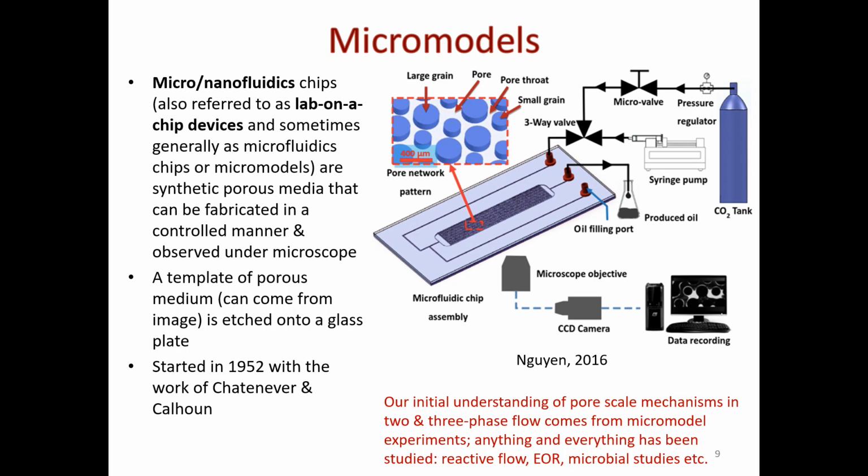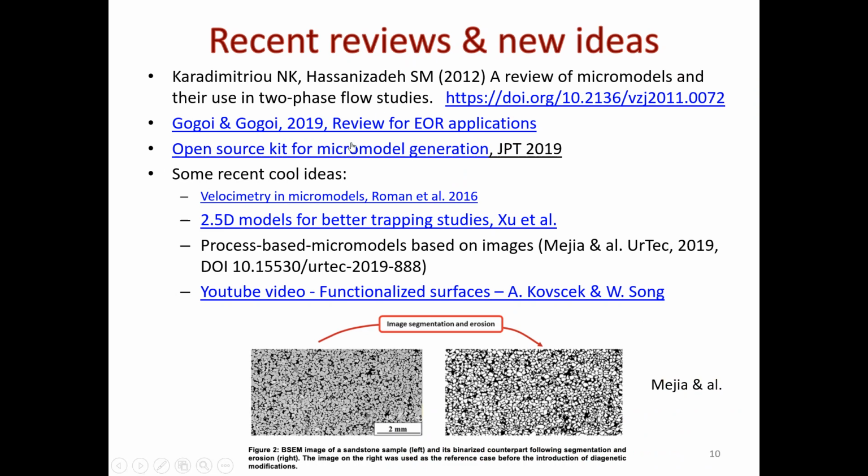Now, Dr. Balhoff and Verden have scaled these down to nanomodels, but you can't use regular microscopy anymore to study them. You have to go to SEM, and it's hilariously difficult just to create your nanoscale model and etch these channels that are 10 or 200 nanometers wide as opposed to 10 to 100 micrometers. 1,000 times difference.